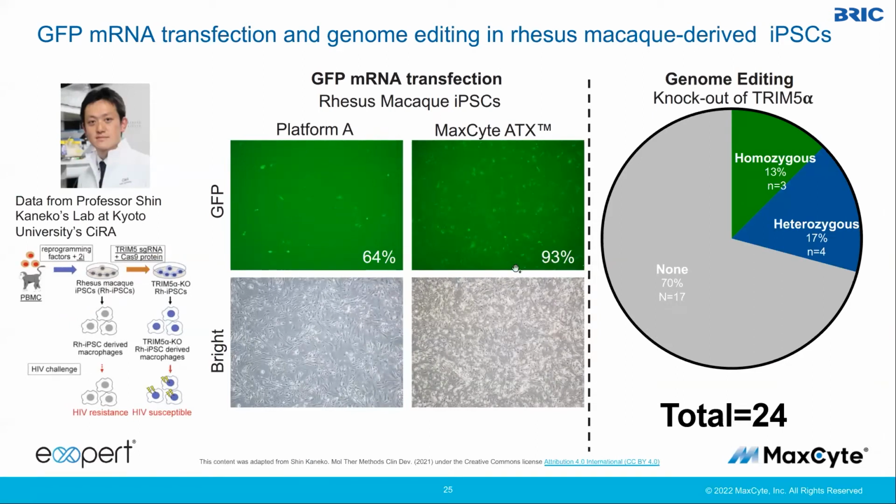So just some optimization experiments initially. They didn't really optimize. They used the same electroporation protocol used for human iPSCs for these rhesus macaque iPSCs with MaxCyte, and were able to get 93% expression of GFP mRNA versus 64% with another platform. Also, the viability was better. But the genome editing was the important parameter.